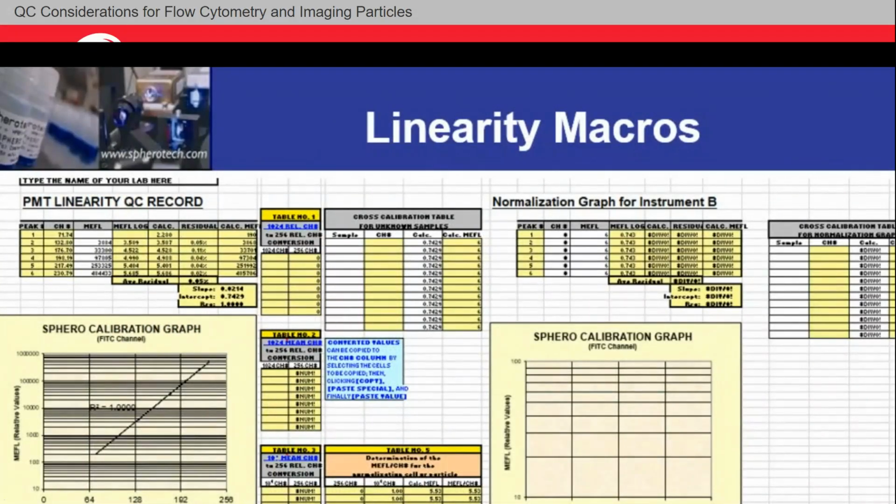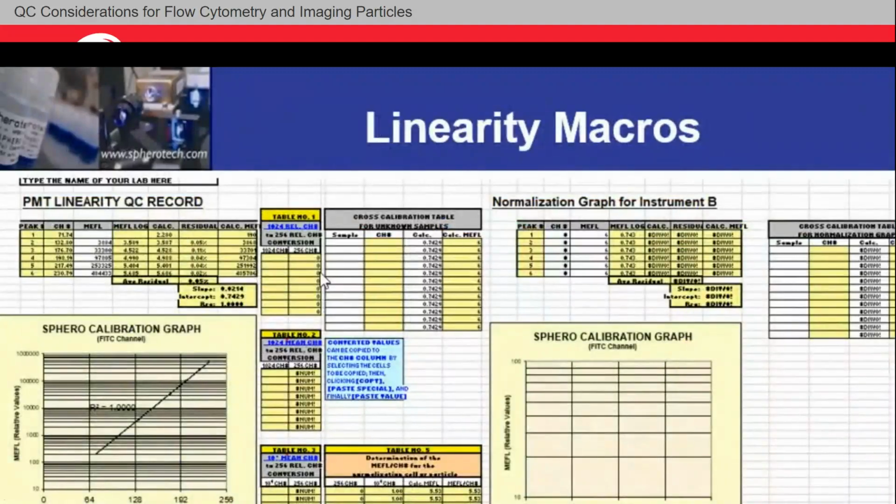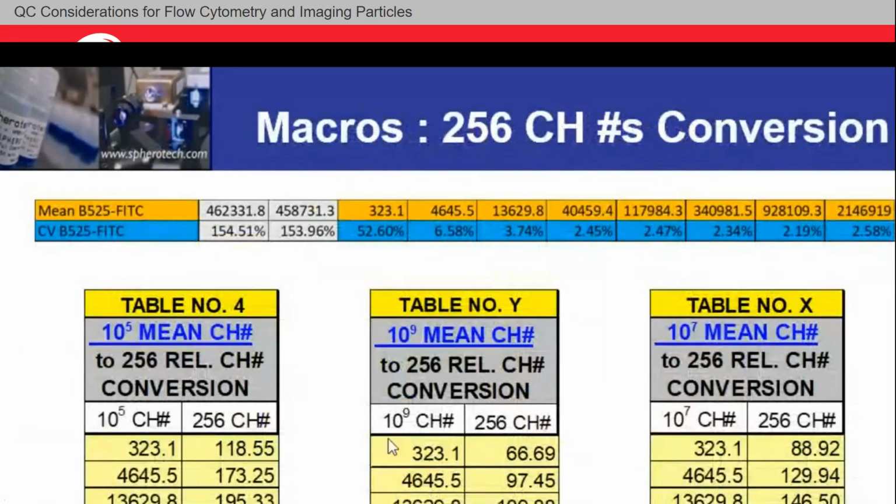These tables, as I've said, some of us have different dynamic ranges. This might be for 10 to the 4. This might be for 1024. You might need to check your manual to determine which one of these is the correct tool for undoing that exponential data, applying the correct log. How do you know? This is a really great way that I like to test, even if I don't know which one I'm supposed to use, because each one of these gets slightly larger. This is a larger log, this is a larger log, this is a larger log. Maybe you need a custom.